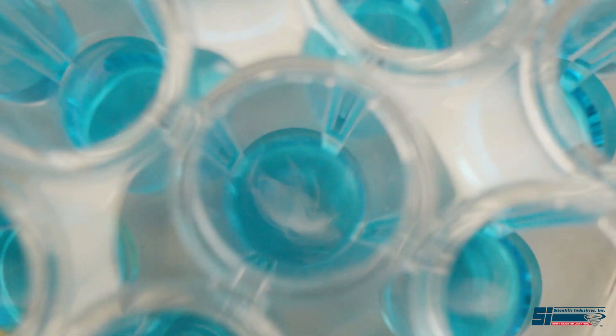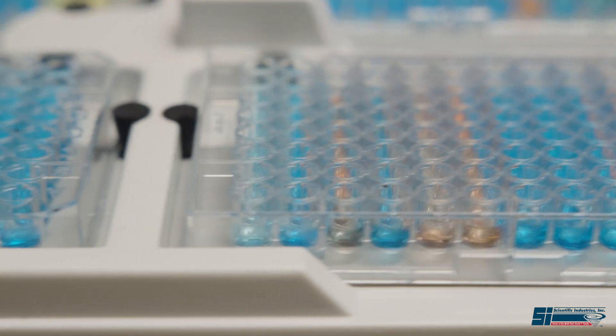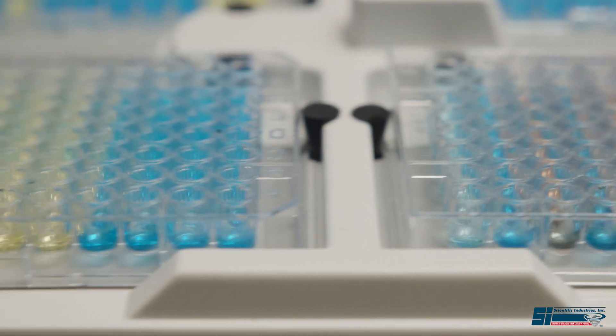For gentle or high-speed vortex mixing, the MultiPlate Genie will achieve the mixing results required for most MicroPlate applications.